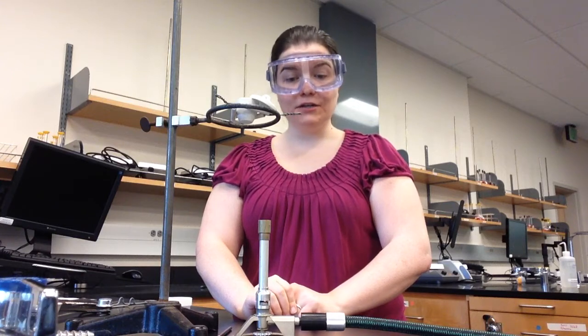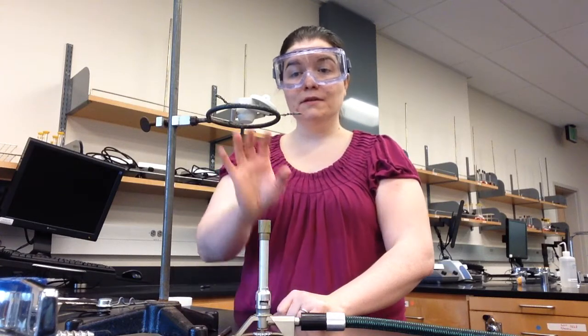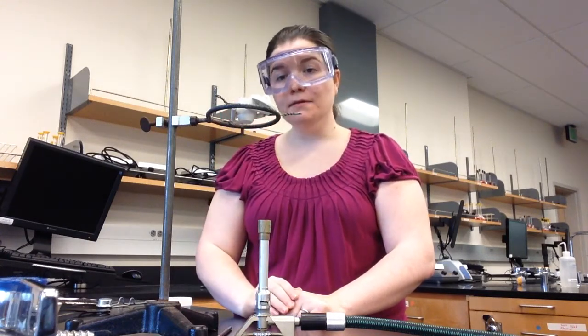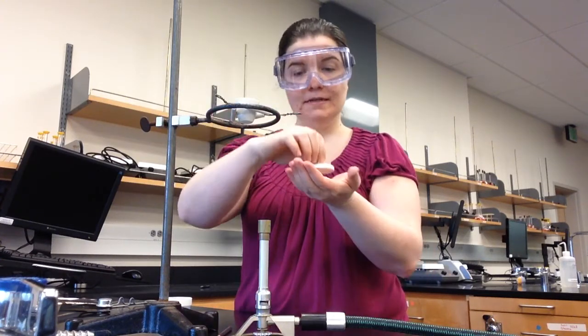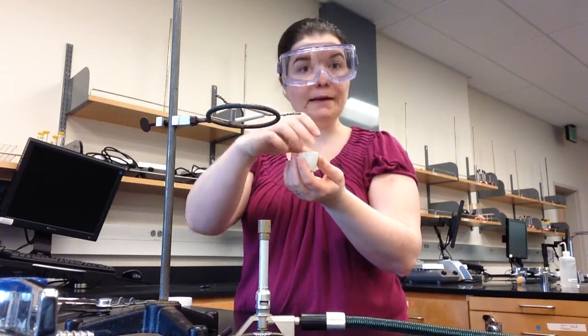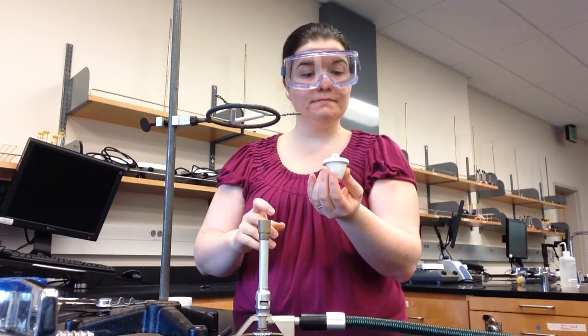After the chemical change has occurred, you should cool the crucible for at least 5 minutes until it's cool. You can cool the crucible right here in the triangle, and once it is cool enough to touch with your hands, you can take the crucible lid and the crucible bottom and any chemical still inside and measure the mass after the change has occurred.